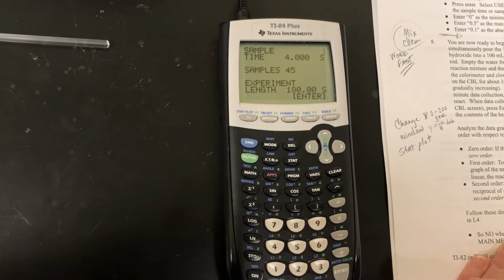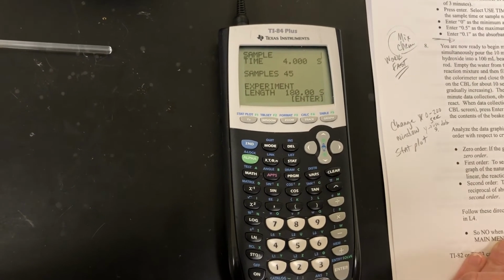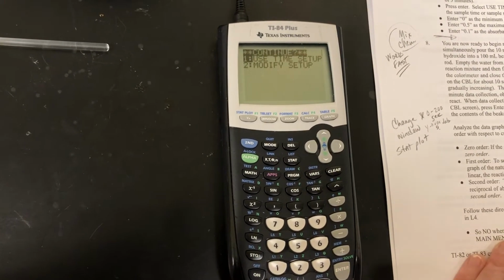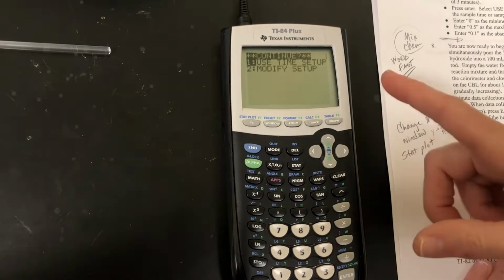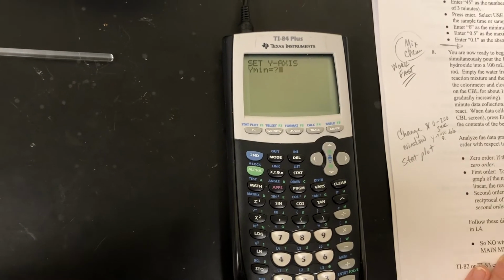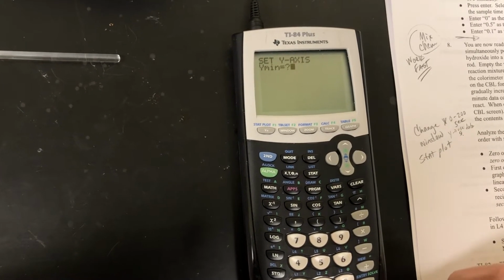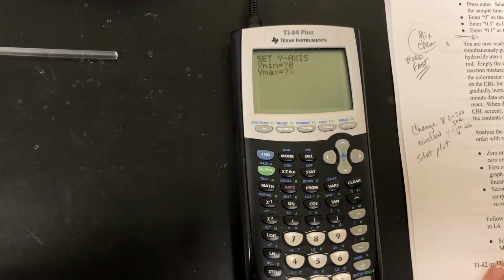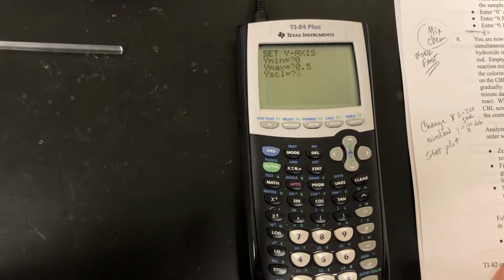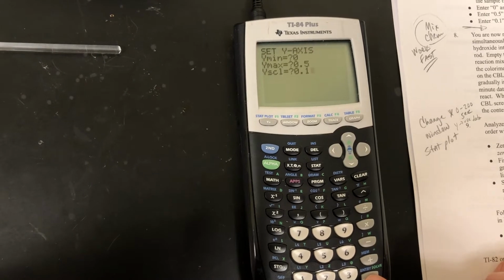And then now they tell us the experiment length is 180 seconds, which is 3 minutes. That looks good based on our sample data. And then we press enter because all that looks good. And we want to use our time setup, so we're going to press 1. Now, they tell us for the values here, our minimum absorbance is going to be 0, so you want to push 0 and enter. Our maximum is going to be 0.5, and then we hit enter. And our Y scale is going to be 0.1, and then we hit enter.